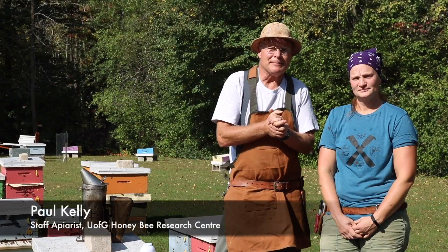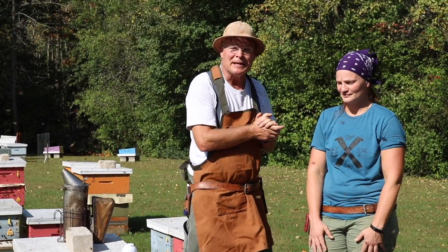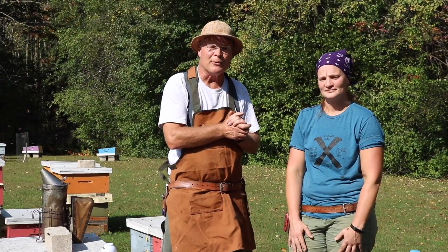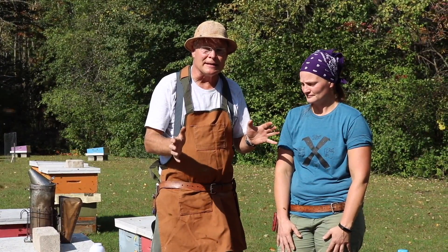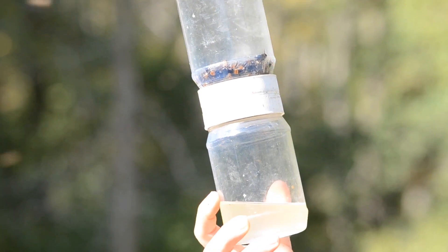We're going to talk about another method of monitoring for mites and I've got an expert with me here to help me with this. This is Melanie Kempers. She works with the Altera Beekeepers Association tech transfer program, so she does a lot of this kind of thing and teaches about these methods quite a bit. The alcohol wash method is what she's going to demonstrate.